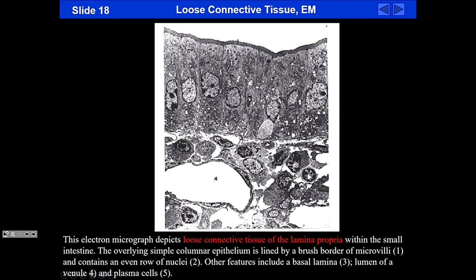This one is a plasma cell, in part, but the eccentric location is the thing that I'm really going on. The cartwheel thing is kind of a matter of judgment. It's kind of iffy. This one's more cartwheel, you've got the central axle kind of thing. Maybe this one too, if that's the cytoplasm. This one is not so clear, but the eccentric cytoplasm off to one side is very characteristic of plasma cells. Question here?